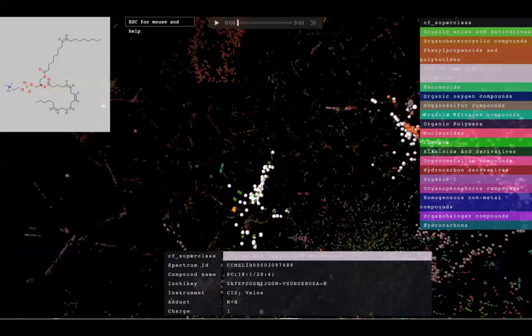And basically what the students hopefully see in the hour that we do this module is that a lot of the same colors are clustered. That is a sign that at least the computer finds some relevant patterns to combine structures of the same chemistry, which on its own I already think is quite a remarkable feat. And I hope that together with Florian and others, we can continue on this to build even better tools.